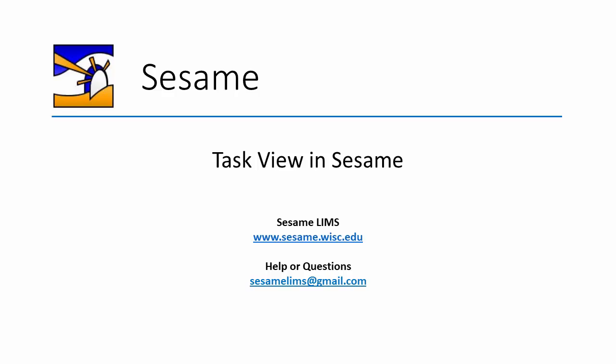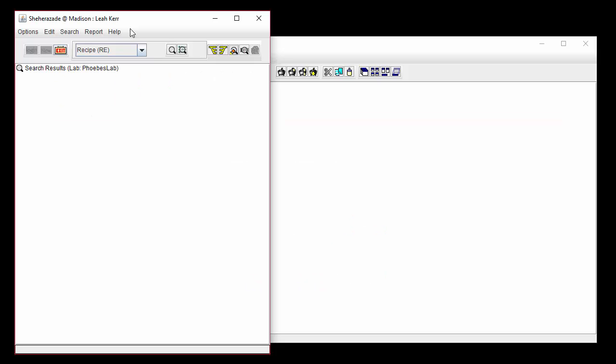In this tutorial, we will be working in the Scheherazade module. The task view allows assignment and tracking of tasks at your lab. To begin, let's create a new task.